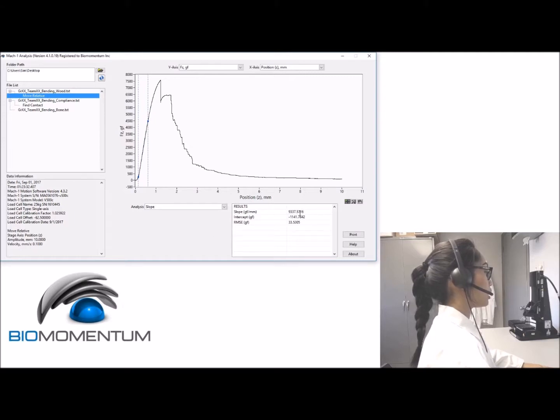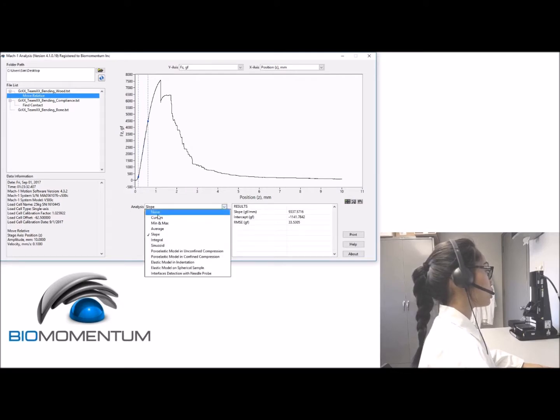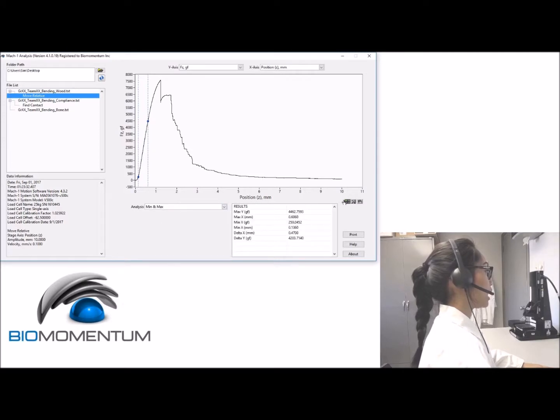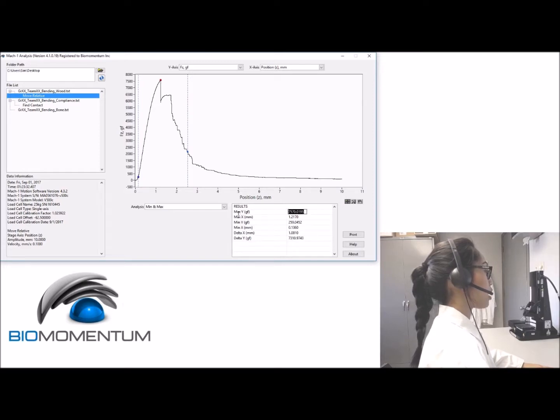Now we will calculate the corrected slope, considering the setup compliance slope obtained previously. We will then analyze the load-displacement curve to obtain the maximum force. In the analysis drop-down menu list, select 'Min and Max' and drag the cursors in a region of interest where the maximum force is needed. The red dot appears and the maximum force corresponds to the max Y in the results field.